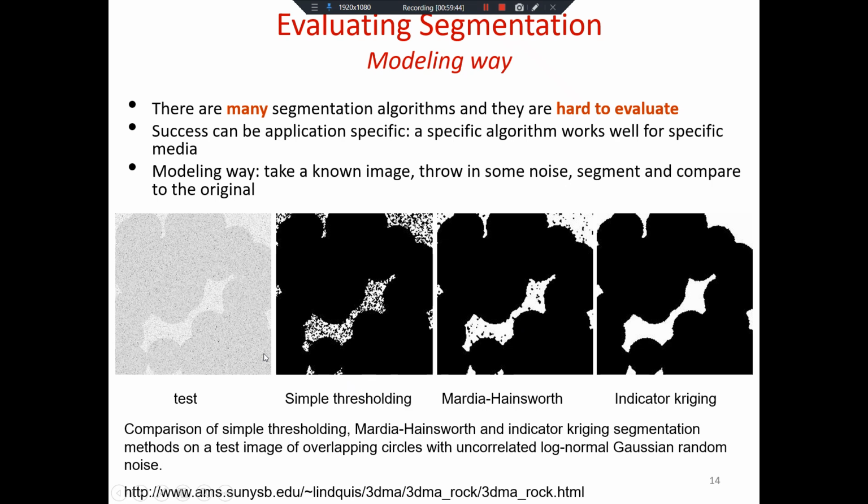This is good. One part of the problem that you do have to be aware of is, does this noise that is here in the image really emulate the noise that is there because of the imaging or reconstruction? The salt and pepper noise that you can throw into your image is not always a realistic type of noise.